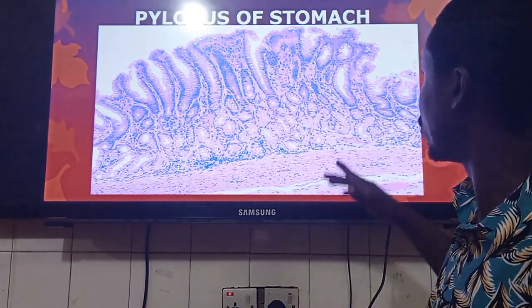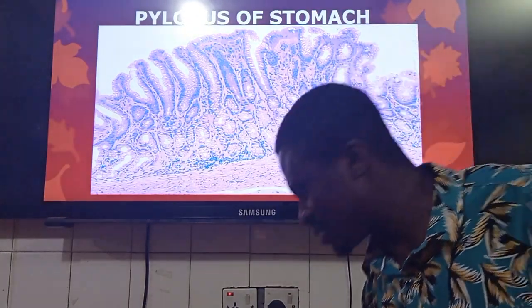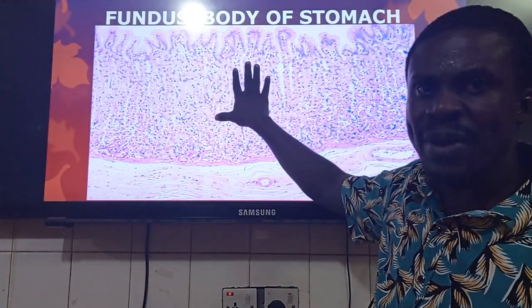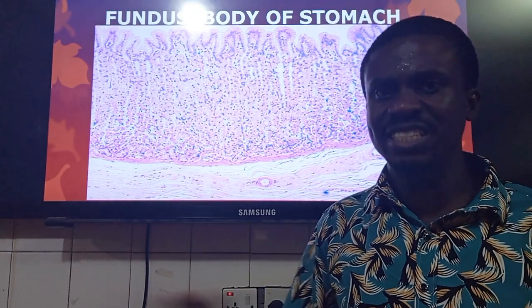Okay, that is one thing I want you to become aware of. So that's what we see, the same organization, just like any other thing. And then this is the fundic part or the body part. The reason is that histologically, these guys are indistinguishable.